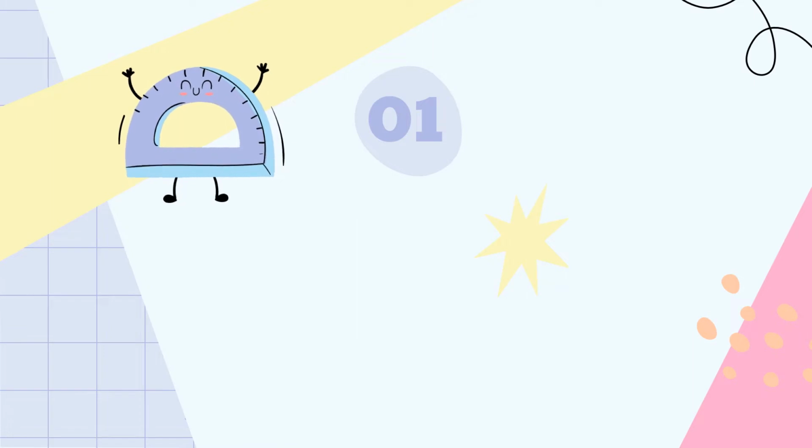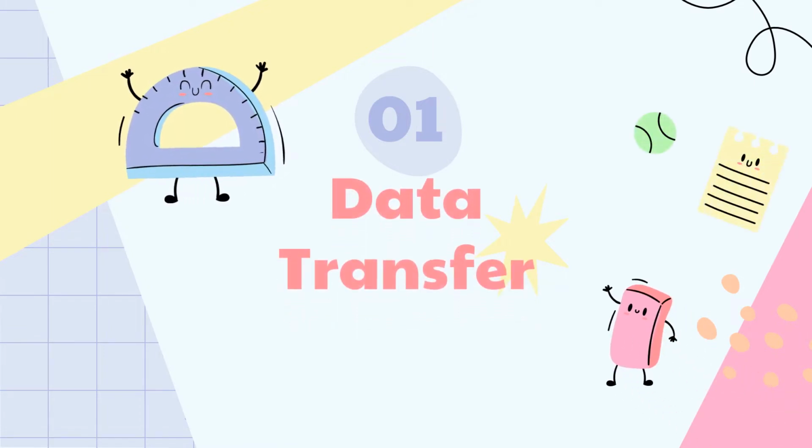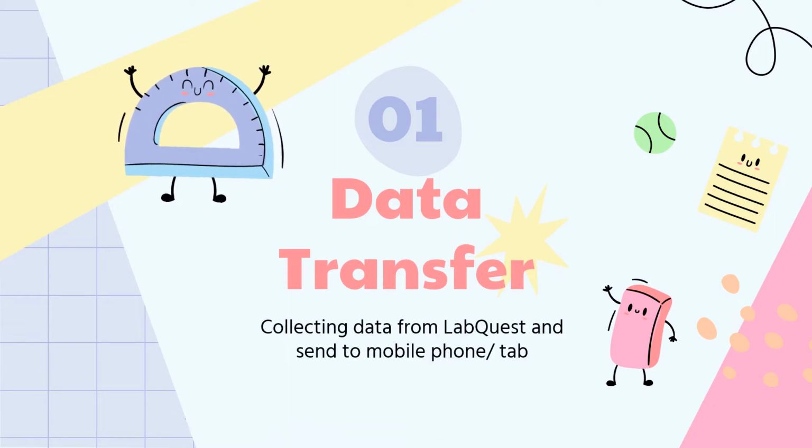So in the first part, we are going to share with you on the data transfer. This is basically on how you want to collect the data from the Labquest and send it to your mobile phone, tab, iPad. It is going to be as easy as ABC. It works for both iOS and Android. Let us have a look.